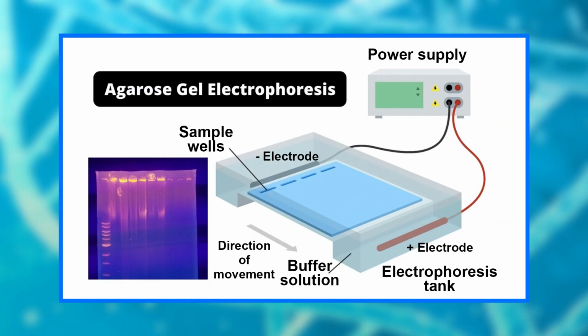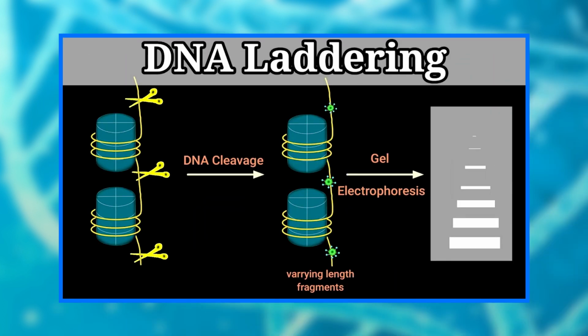To check whether the PCR successfully generated the anticipated DNA target region, also sometimes referred to as the amplicon, agarose gel electrophoresis may be employed for size separation of the PCR products. The size of the PCR products is determined by comparison with a DNA ladder, a molecular weight marker which contains DNA fragments of known sizes, which runs on the gel alongside the PCR products.